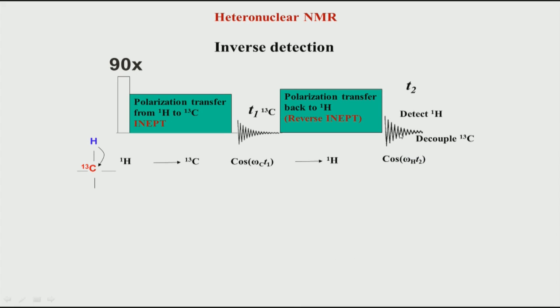This is called the direct dimension, this is called the indirect dimension. So, indirectly the chemical shift of this is captured finally in the FID. So, now we have basically correlated the two chemical shifts, because remember the final FID is a combination of this component and this term. So, we have two terms intermodulated with each other, and we do a 2 dimensional Fourier transform, because I have 2 axes.